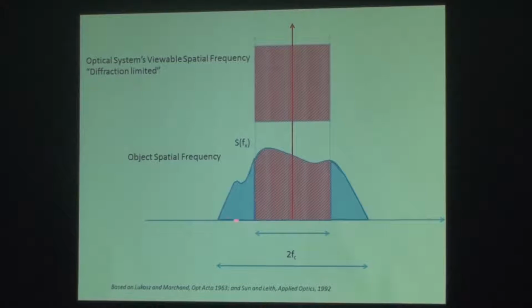So these are the two spots. Imagine those two spots which are unavailable for the optical system. And this is the conventional field of view imaged by the system, which is your 1x. And this is twice the frequency which the conventional system doesn't pick up. So the point now is how we will transfer this frequency into the observable field.